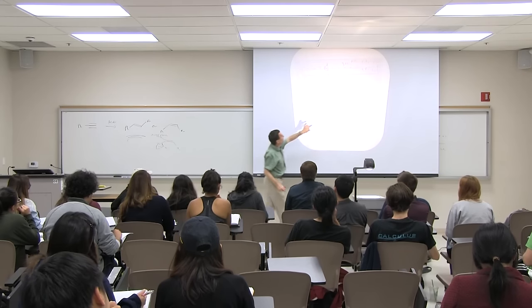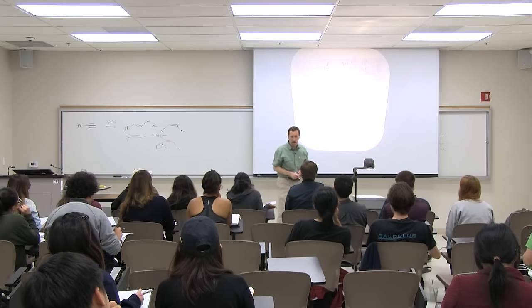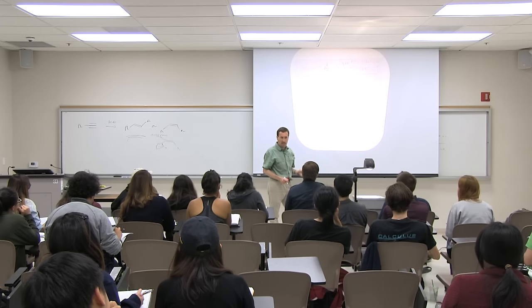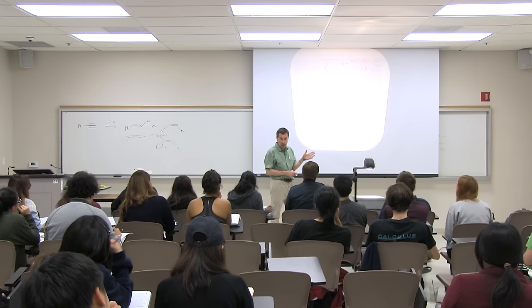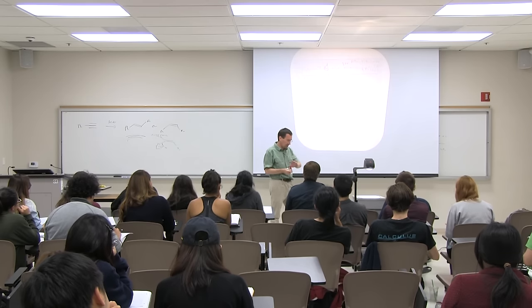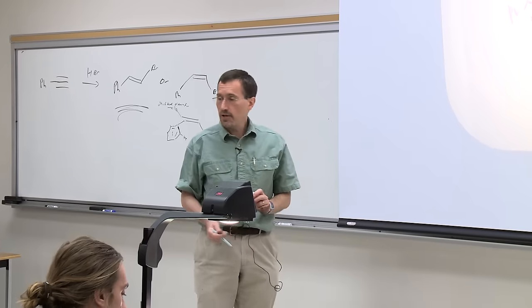That is a big difference in chemical shift for two protons on an alkene, but it's in no way surprising. I often see protons at 8 parts per million for an alkene, or 7-ish. Remember, I said 5 to 6 is sort of a range. Other questions?